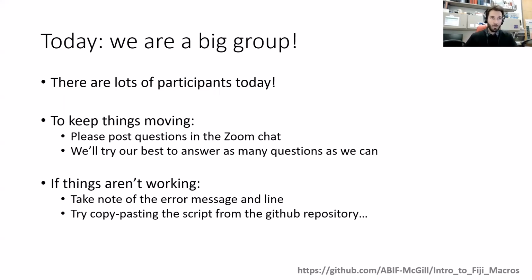If things really aren't working, so if you have problems installing Fiji, I don't think we'll address that directly in this workshop, but all the code is available on the GitHub. And so you'll be able to basically go to the GitHub and copy paste there. And hopefully that will work out. We'll talk about where to copy paste it as we go. Hopefully everyone has access to the GitHub, has tried it, and has downloaded the images.